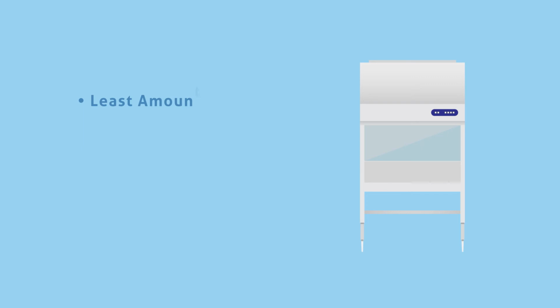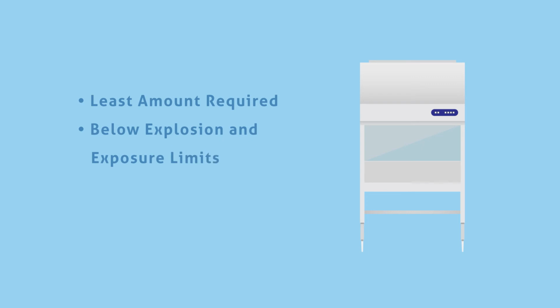Minute specifically refers to the least amount of chemicals needed for the experiment currently being conducted. This amount must always be below the explosion and exposure limits for that chemical and stored in appropriate containers that are preferably capped and shatterproof.